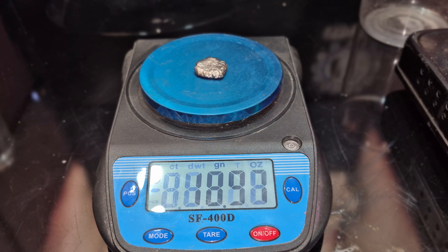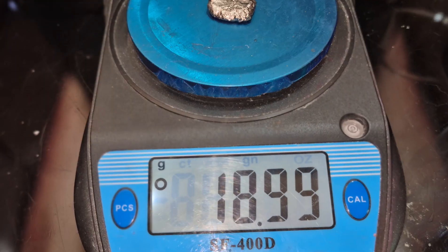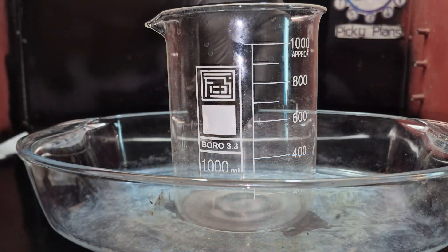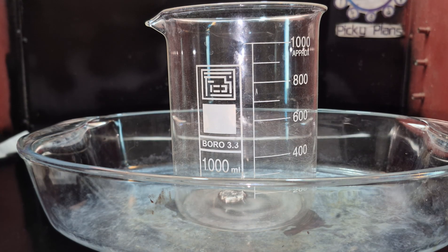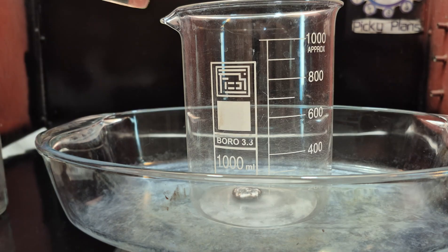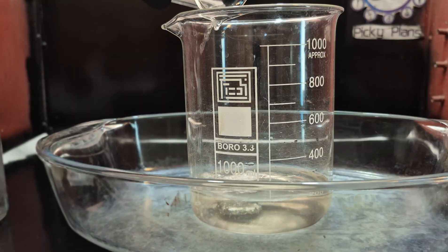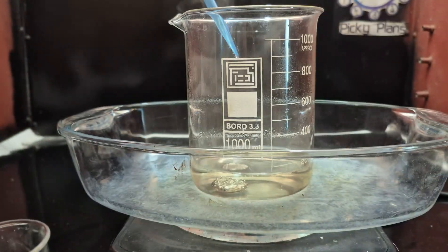Hello, refining enthusiasts. In this video I have a piece of impure palladium metal that I'll be refining. It contains some silver contamination along with traces of copper. To refine this alloy I'll be using aqua regia digestion, which is my preferred method. I began by adding about 200 milliliters of hydrochloric acid to start the process.